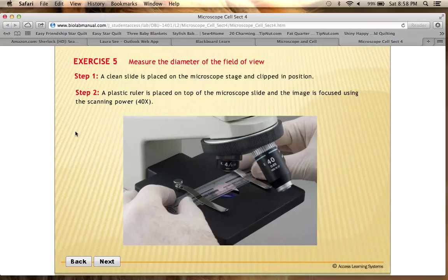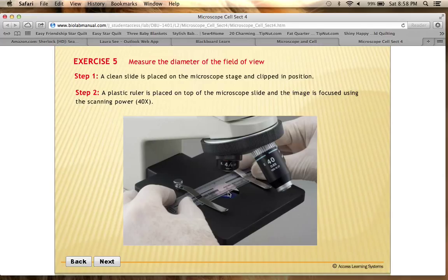Students are having trouble with measurement in the microscopic field, so let's go through this. Here we are looking at a microscope. There is a slide down here with a ruler on top of it, and we're looking at the millimeter marks on the ruler. We're going to focus on that using the scanning power objective, which is the 4x objective.